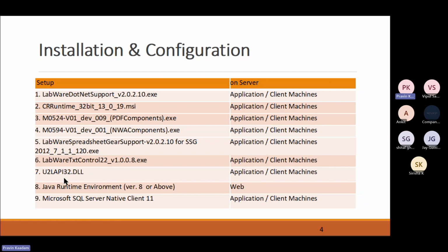LAPI is one of the requirements of Crystal report. I have been using Crystal report for more than 20 years as of date. Since the day I started using Crystal report 20 years ago, this file needs to be installed separately. Even today, after you install Crystal report, you have to copy this file separately, so we have specified a separate step for that.